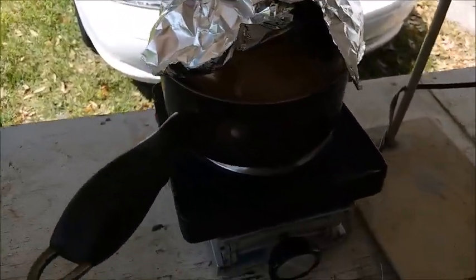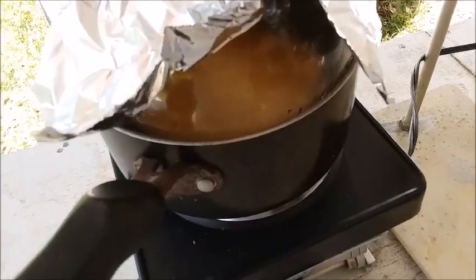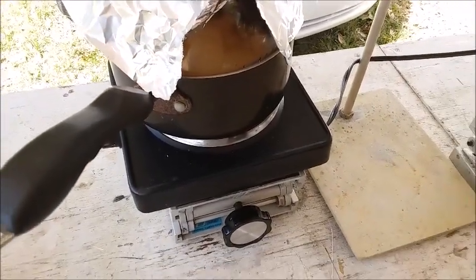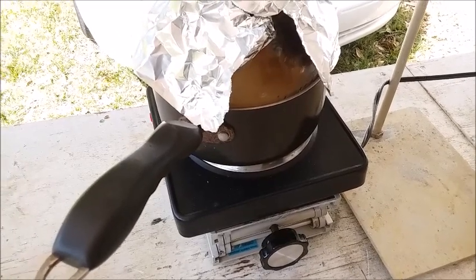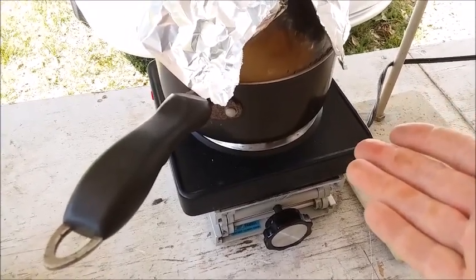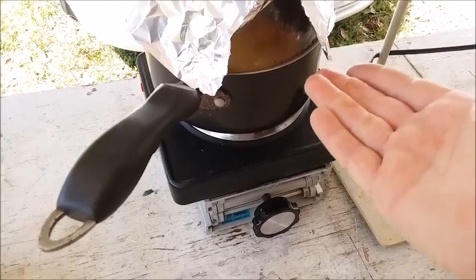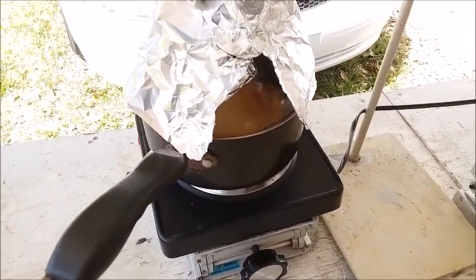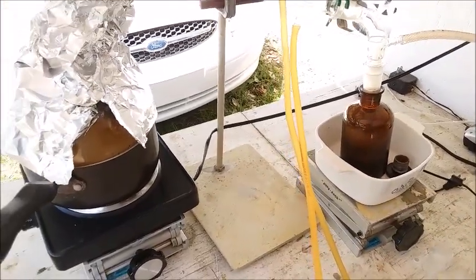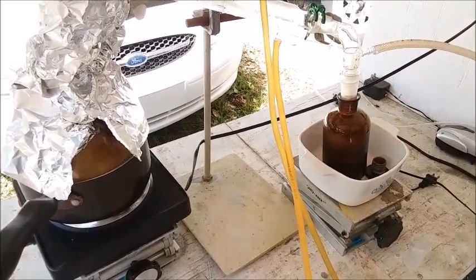One other thing I have found: what I was doing in the past was, once this flask of reactants is done, I would swap it out with my other boiling flask full of fresh reactants and keep going. What I have found is I can put up to about three batches of reactants into this flask one after another and just keep running it, and then only have one flask to clean up at the end. I wouldn't go more than about three because the flask starts getting full and foam over into the condenser becomes more likely. So nitric acid production is getting easier and easier and I'm getting more and more of it with each run — I'm really happy with this setup.